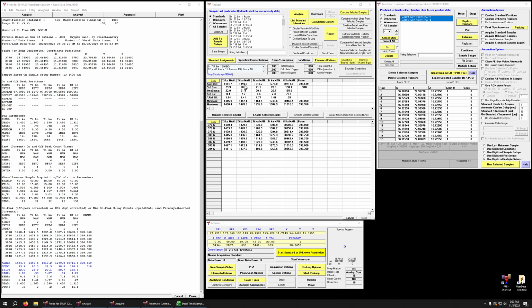We won't go into it much in this video, but it also can show you interesting artifacts in your instrument, such as the calibration of your picoammeter, tilt in your stage, and probably other things that I haven't even thought of. It's quite sensitive and quite a powerful technique for evaluating the condition of your instrument and how well it's tuned.